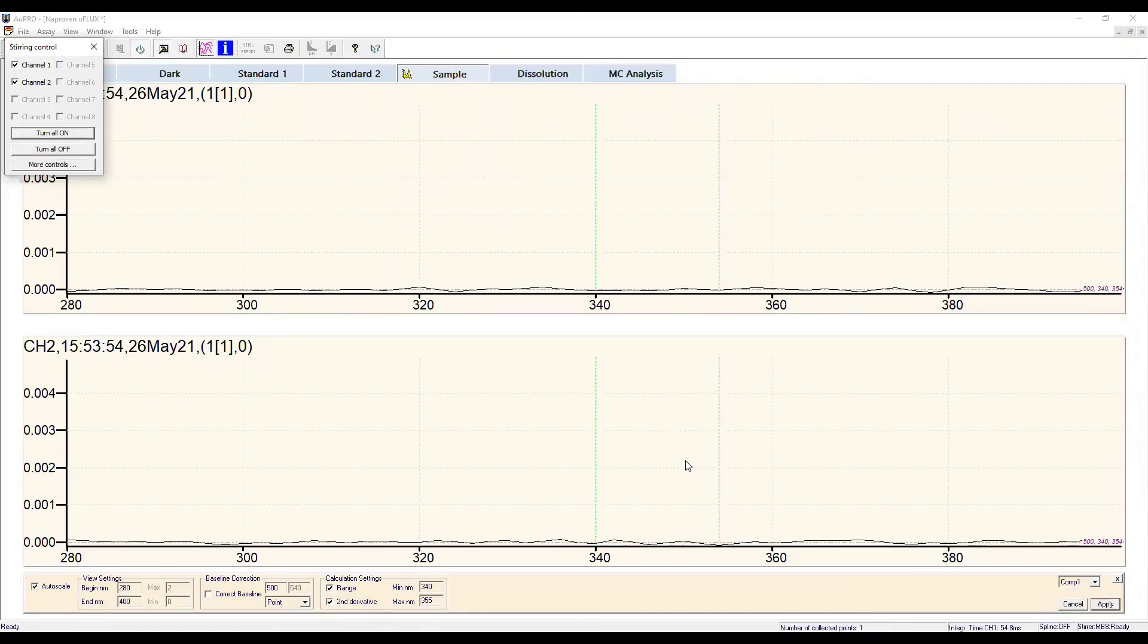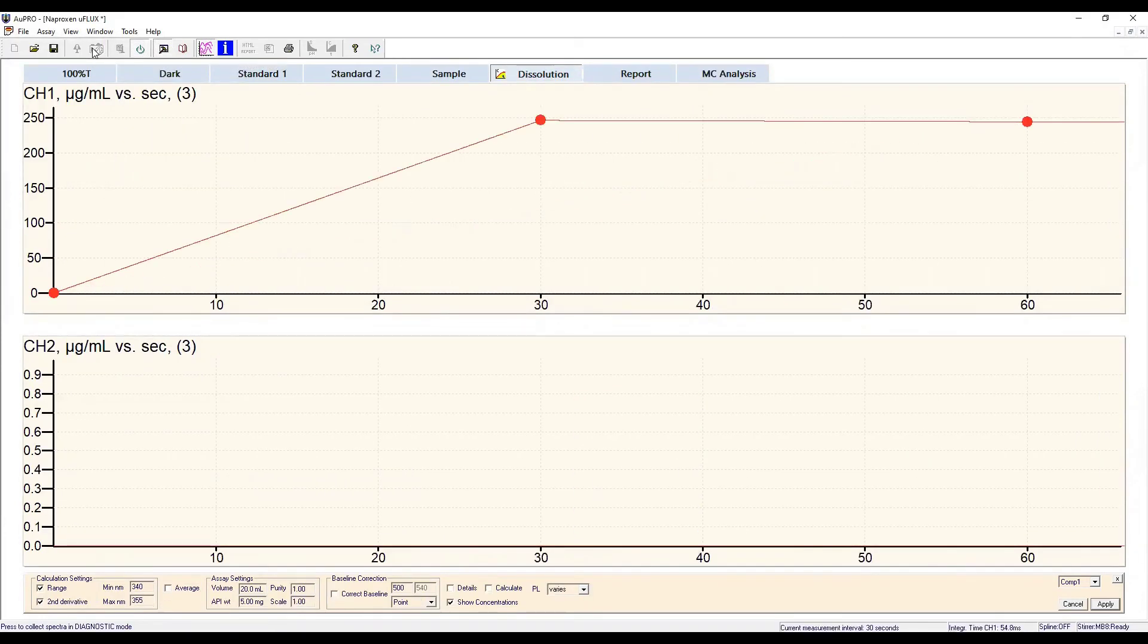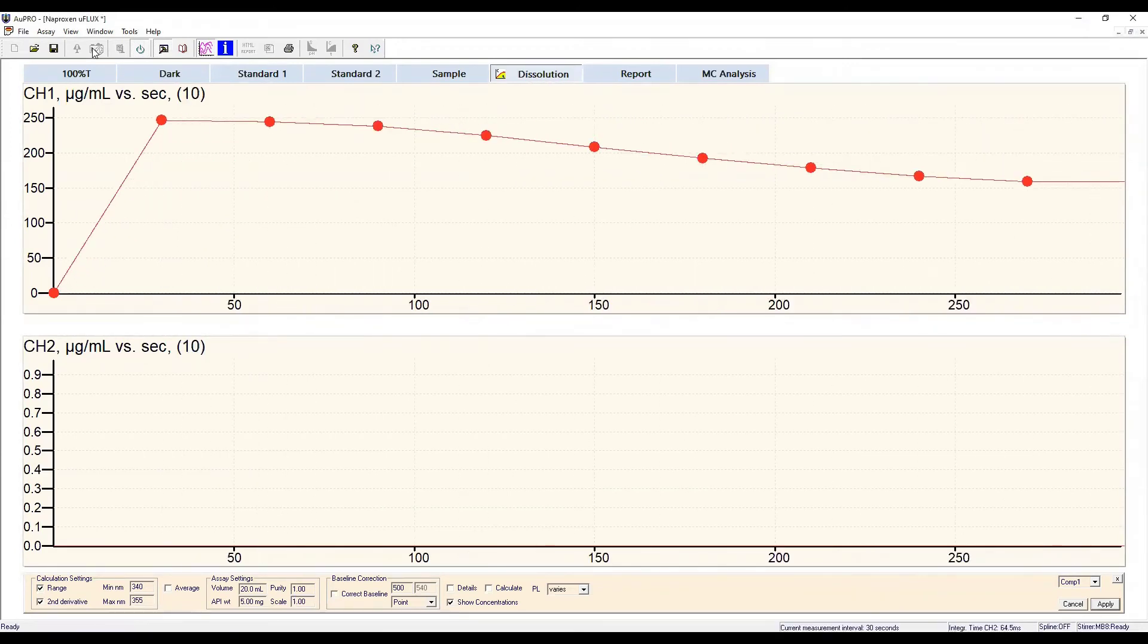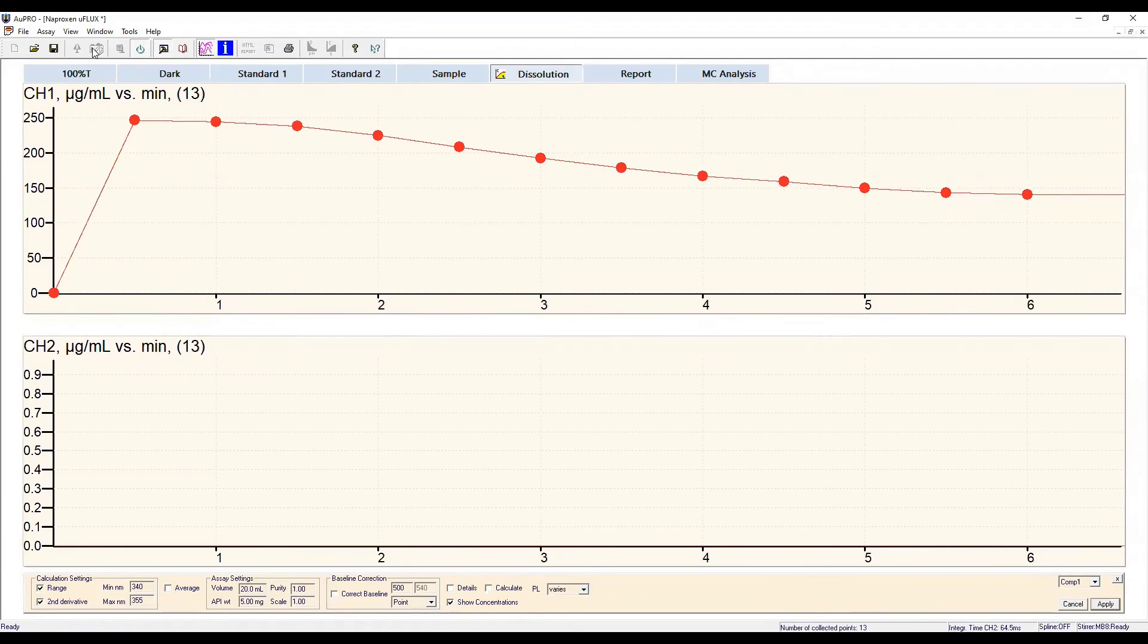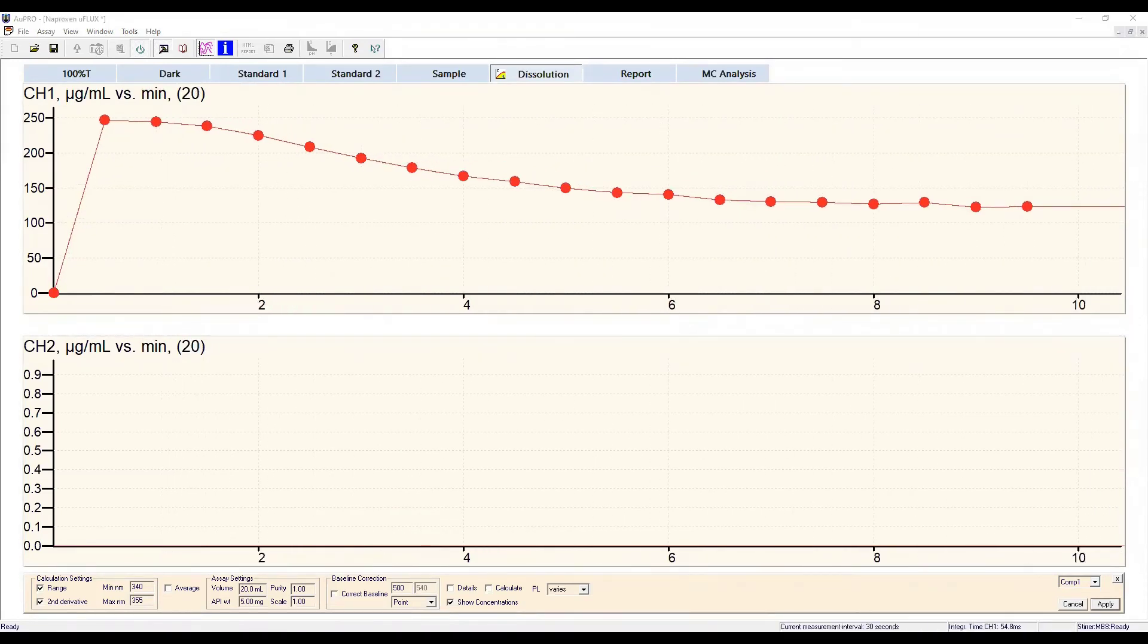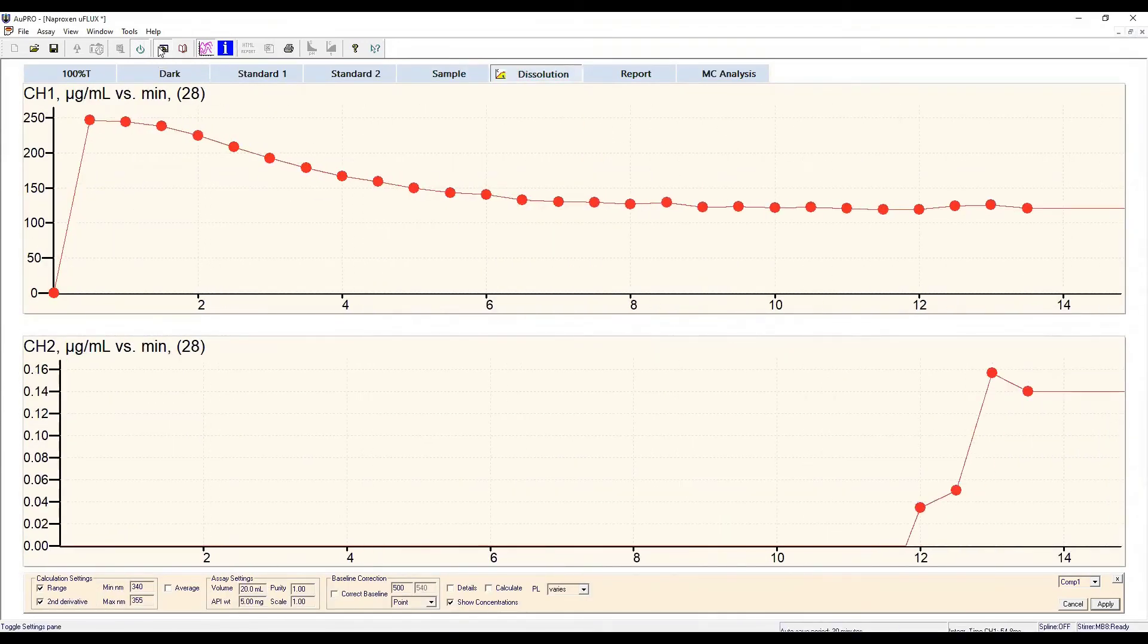The instrument starts to collect spectra, and the dissolution curves are populated in real time. This section of the data collection is sped up. In the donor chamber, addition of the sample as a concentrated stock solution briefly supersaturates the sample, but we start to see precipitation within the first few data points, and by 10 minutes, the concentration reaches the intrinsic solubility.